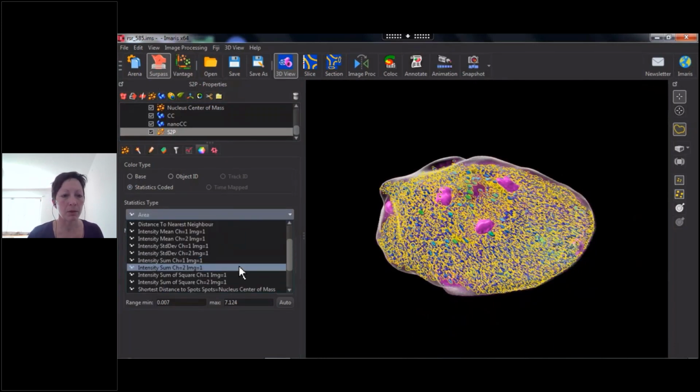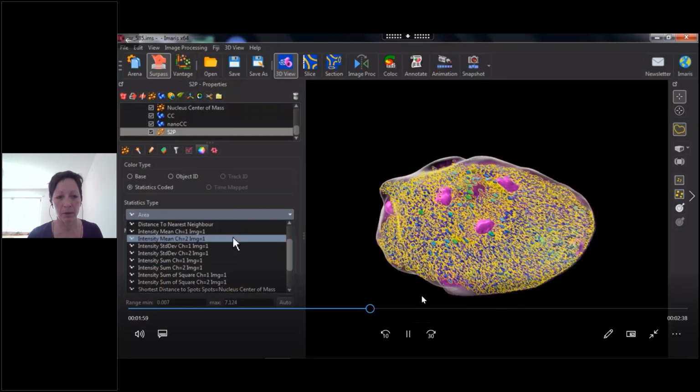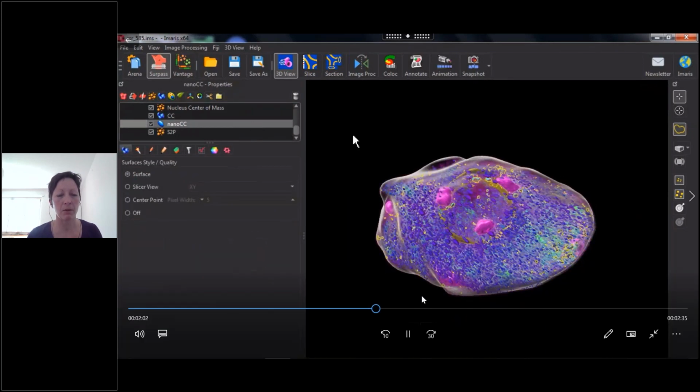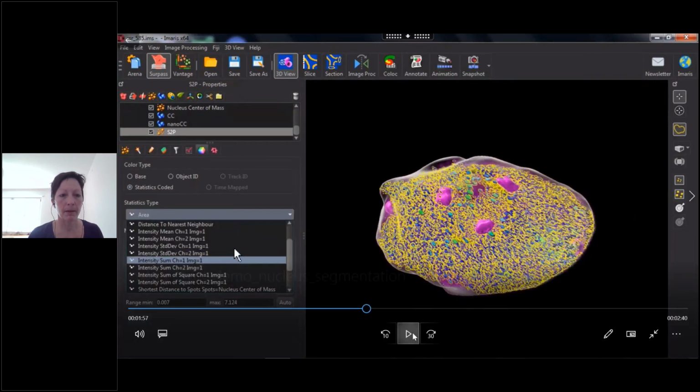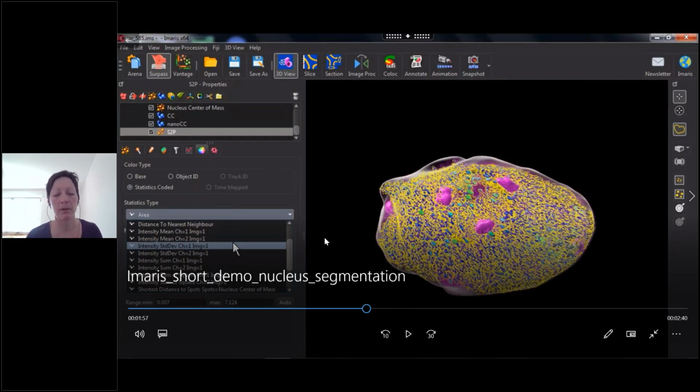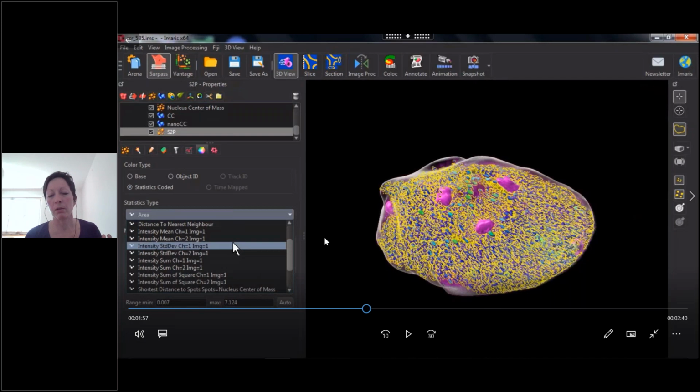And now, what I'm showing you on this animation is that this antibody signal is now defined as spots. Sorry, I might go back quickly to the previous step. Now, each of the objects that have been created in IMARIS captures parts of the image, and by capturing part of the image, you can read whatever is inside this little object. So that means you can read the intensity inside the object, the intensity sum, the intensity mean, the standard deviation, and you can also have distances which are derived from the position of the individual spot.